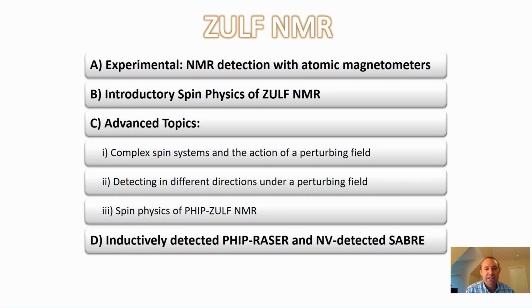So I think it kind of depends on the range. The way I mean it in this moment, and the very easy answer, is that if you have no magnetic field because you're at zero field, then it's very easy to shim. So obviously all you need to do is try to make your field as close to zero as possible, and then you will be able to get very narrow lines. If you move to higher magnetic fields into the millitesla regime, this argument of course becomes much more difficult. Shimming is not as easy as I make it out to be maybe here at first sight, but it is certainly true that susceptibility artifacts are reduced.